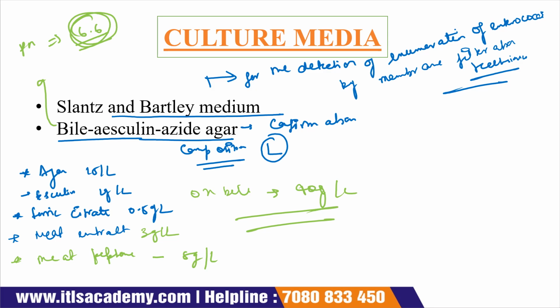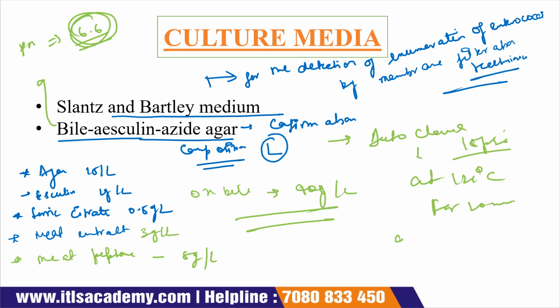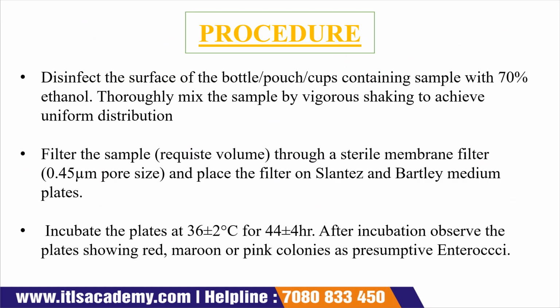After it, we autoclave it at 121 degrees Celsius for 20 minutes at 15 psi pressure, for the elimination or killing of all types of microorganisms. After that, we go to the next part, that is the procedure.